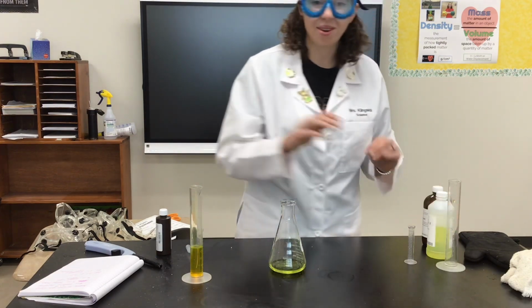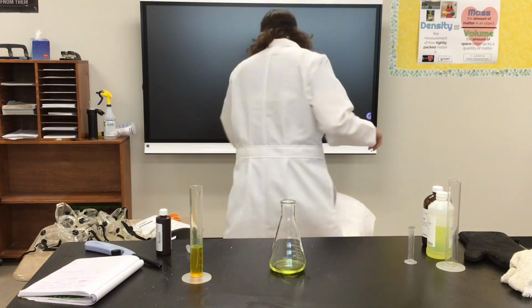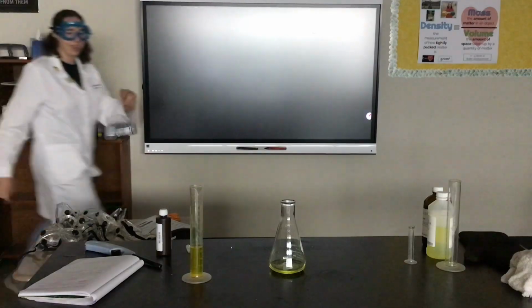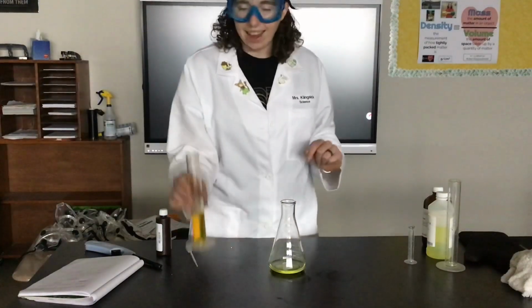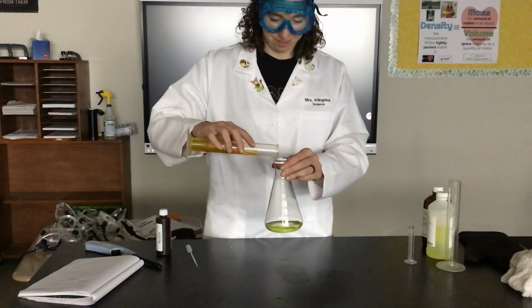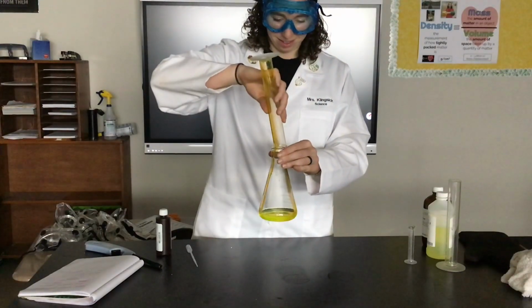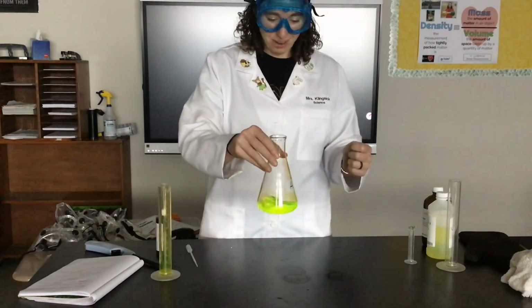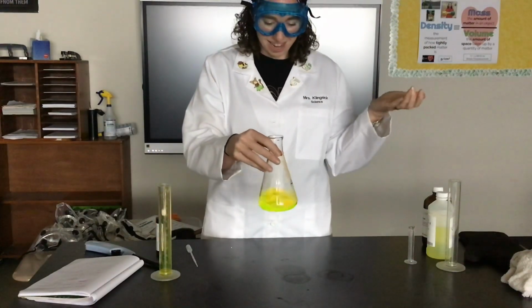Okay, and then what I'm going to do now is turn off the lights. Okay, and now I'm going to add in my energetic light solution. Let's see what happens. Do you see it? Whoa! It's a glow stick. So we just actually created a glow stick in a glass.